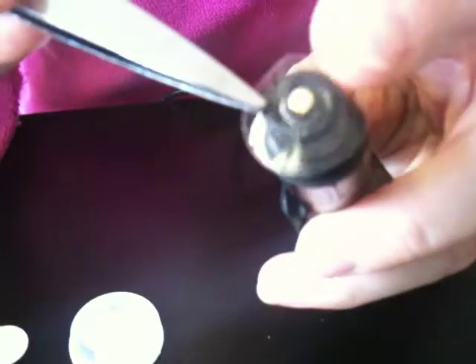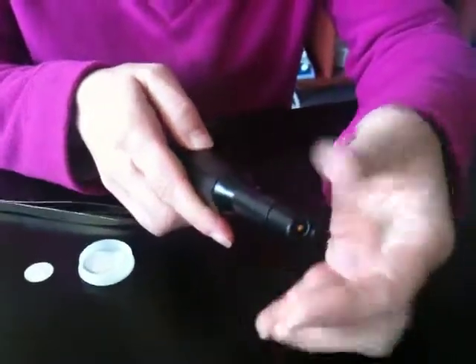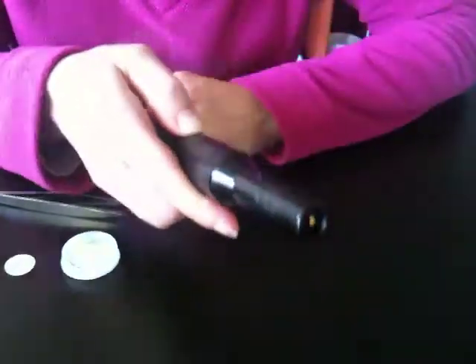This right here is the diaphragm. It looks like cellophane. You're going to position that sort of in the middle. This is a little bit of the tricky part, but you're going to get that O-ring and you're going to snap that right back on. Good. And you're good to go. And you're going to screw that cap back on, and we'll handle the filling of electrolyte in the next portion.